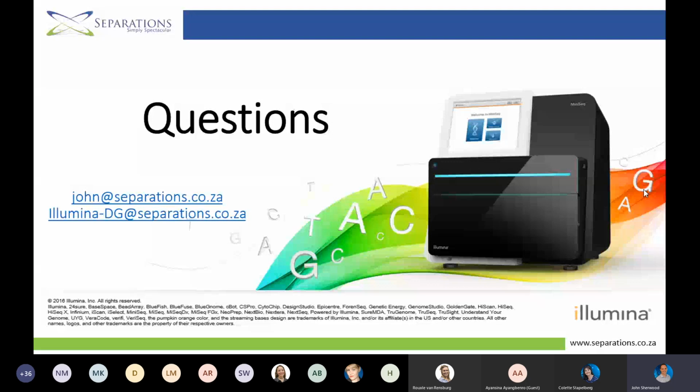Okay, would you be using the same kit on the MiniSeq and the MiSeq for microbiome studies, or are they specific for each instrument? Very good question, Fadila. No, you would use the same kit, and it's simply the plexity of your samples that will differ. For example, on a MiniSeq you might do 16 samples, whereas on a MiSeq you might be able to go up to 48 samples or even higher. But the kits, the library preps, and usually the workflows will be identical over both instruments.